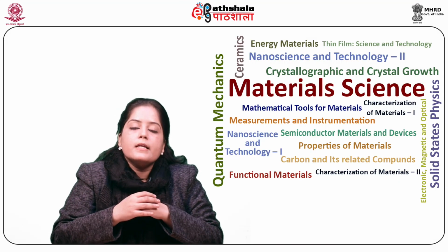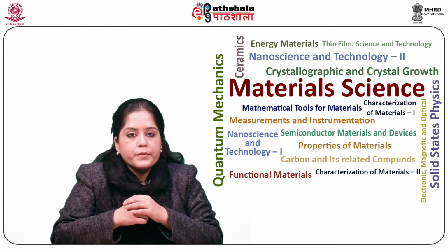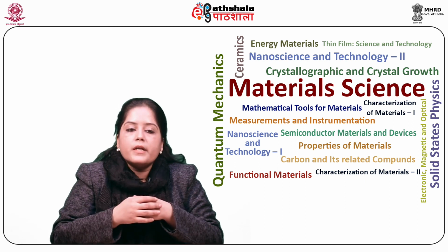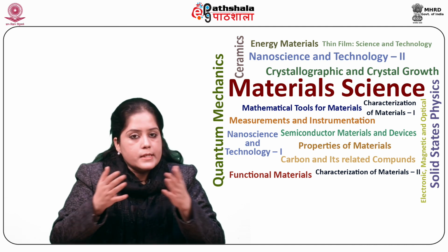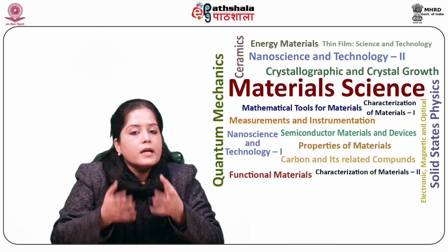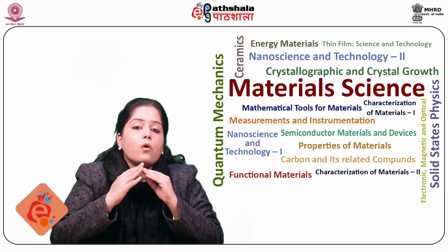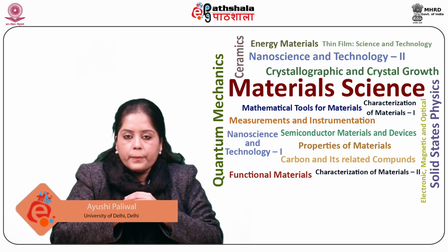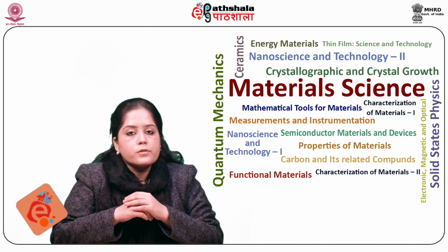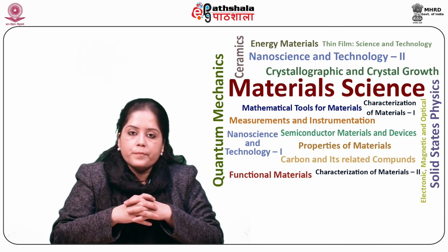So students, let us summarize what we have learned in this module. First, the working principle of AFM along with its operating principle was discussed in detail. Second, the AFM imaging modes, that is static mode, lateral force mode, and dynamic modes, were all discussed in detail. Lastly, we discussed piezoresponse force microscopy, PFM, along with its working principle. Thank you.